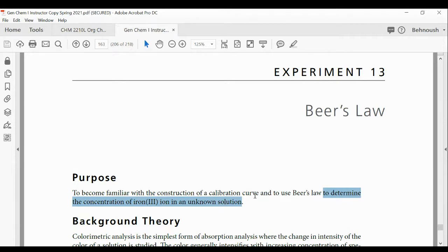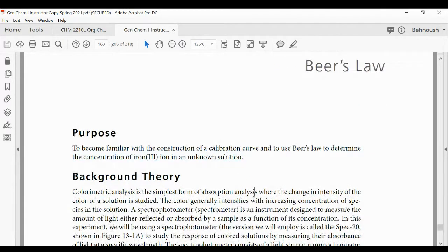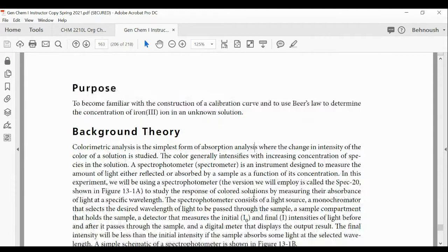Okay? Again, it shows a pattern. The higher the concentration, the higher the absorption of light. So if you know that, and you have a graph or a calibration curve, you can do like experiment 12 and find, if it's a direct relationship, then you can just use the mathematical operation. But if it's not direct, you can create your calibration curve yourself. So in this experiment, we are first working on the calibration curve, and lastly, you would test an unknown solution against your calibration curve.